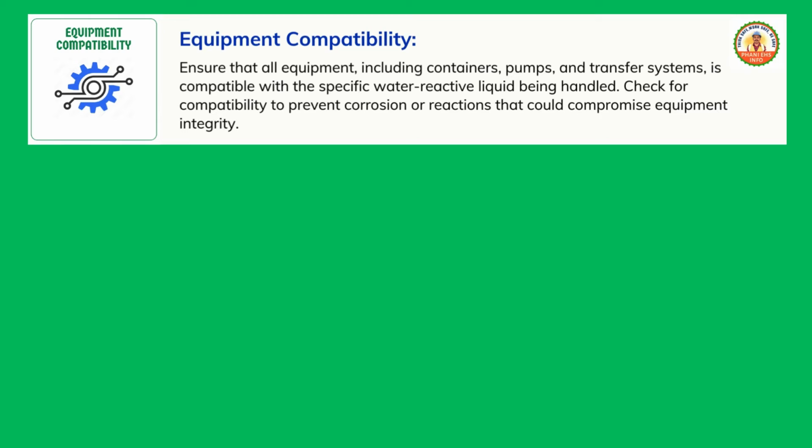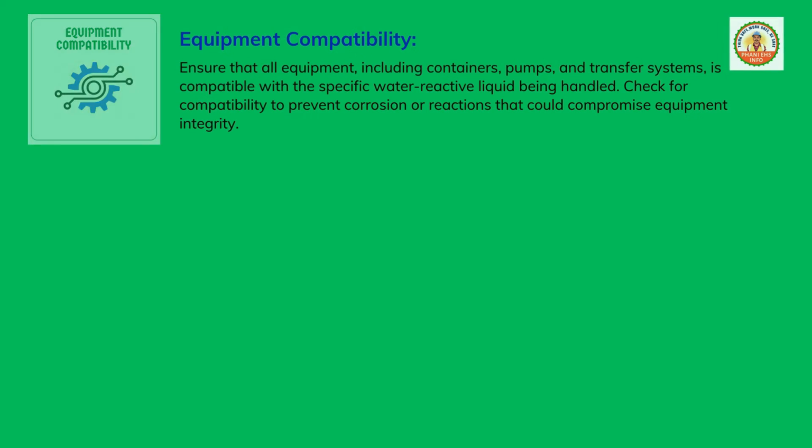Equipment compatibility. Ensure that all equipment, including containers, pumps, and transfer systems, is compatible with the specific water-reactive liquid being handled. Check for compatibility to prevent corrosion or reactions that could compromise equipment integrity.